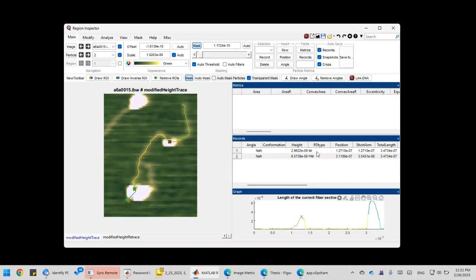So we have one specific complex labeled as SP, and that's this complex, and another complex is a non-specific complex, and that one. For my complex, specific complex means it's binding to a specific structure or sequence that we already know beforehand, right? Because we engineer these DNA molecules, so I know where the structure is.